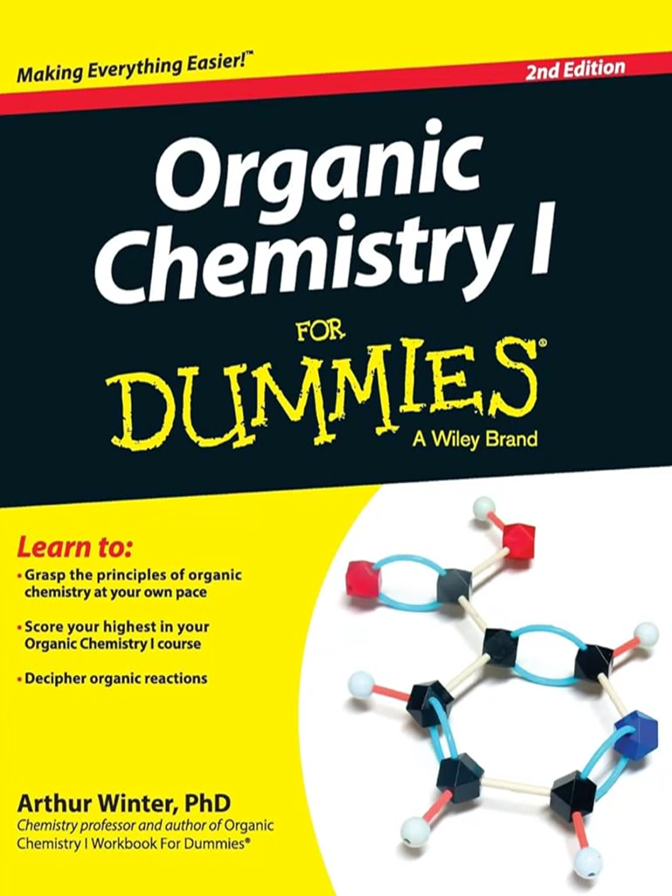Got it. Then you have alkynes, C≡C, the carbon triple bond stretch itself. These typically produce medium intensity absorptions in a higher range, between 2,100 and 2,250 cm⁻¹. Quite distinct. 2,100 to 2,250 for the triple bond. Yep. And right near there, you also find nitriles, C≡N, the carbon-nitrogen triple bond. These are also usually medium intensity and typically appear between 2,200 and 2,250 cm⁻¹, so they overlap somewhat with alkynes. Context usually helps tell them apart. Okay, C≡C and C≡N both around 2,200. That's the zone.